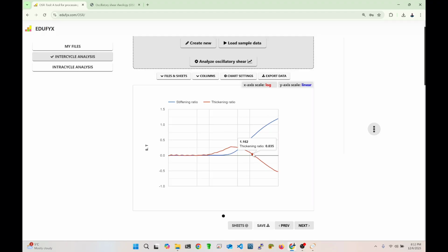So now you can see the benefit of the stress filtering. And why this happens is because the noise that we saw previously is because of differentiation noise, I believe. Because differentiation is highly affected by noise, so you probably want to do stress filtering for the smaller strain amplitude and then leave the higher strain amplitude unfiltered.